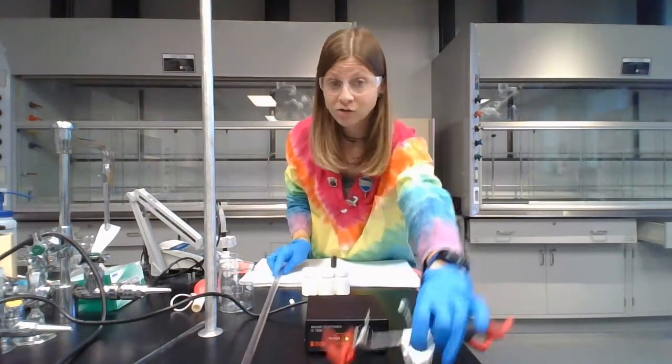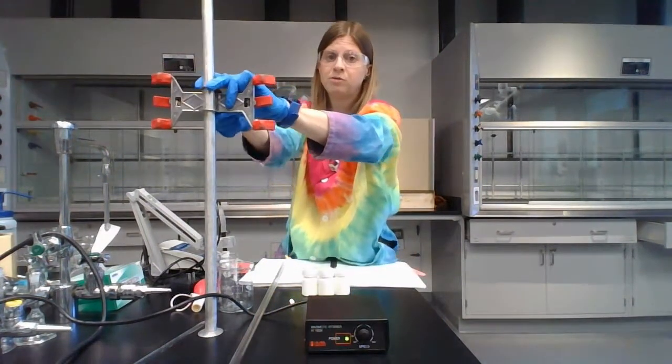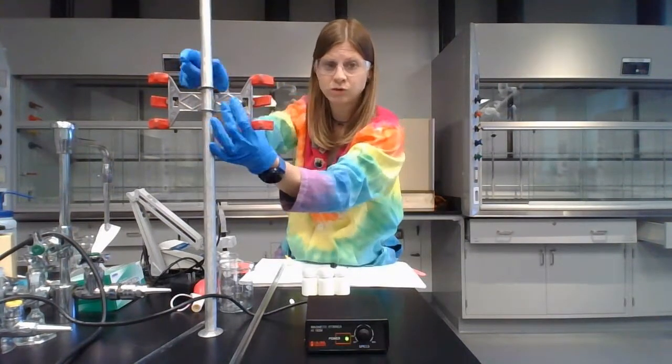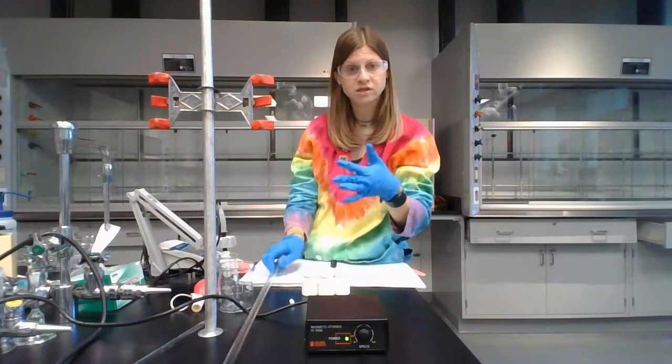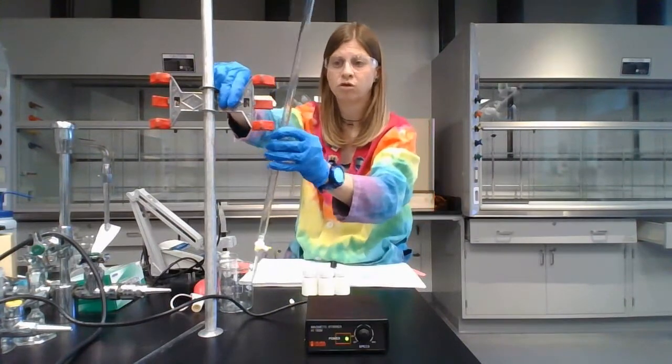Just like whenever we use a burette, we will use a post and a burette clamp. Now when we put on the burette clamp, the post has to go through the 2 rings. We don't use these sides to attach it to the post. Those aren't sturdy enough for that. Those clamps, the clamps on the left and the right, are for the burette.